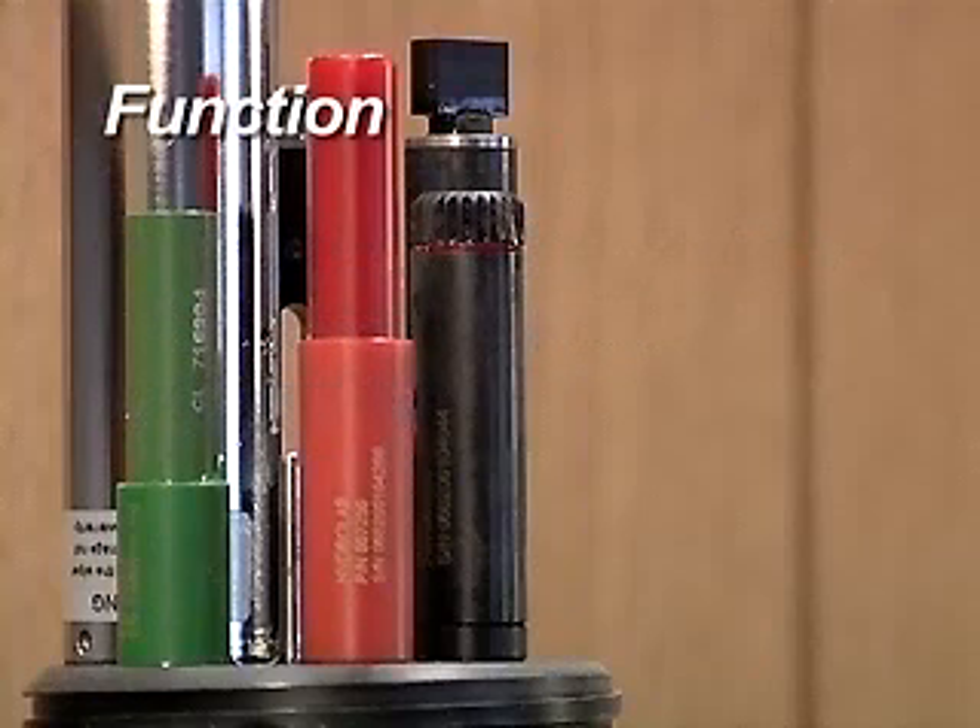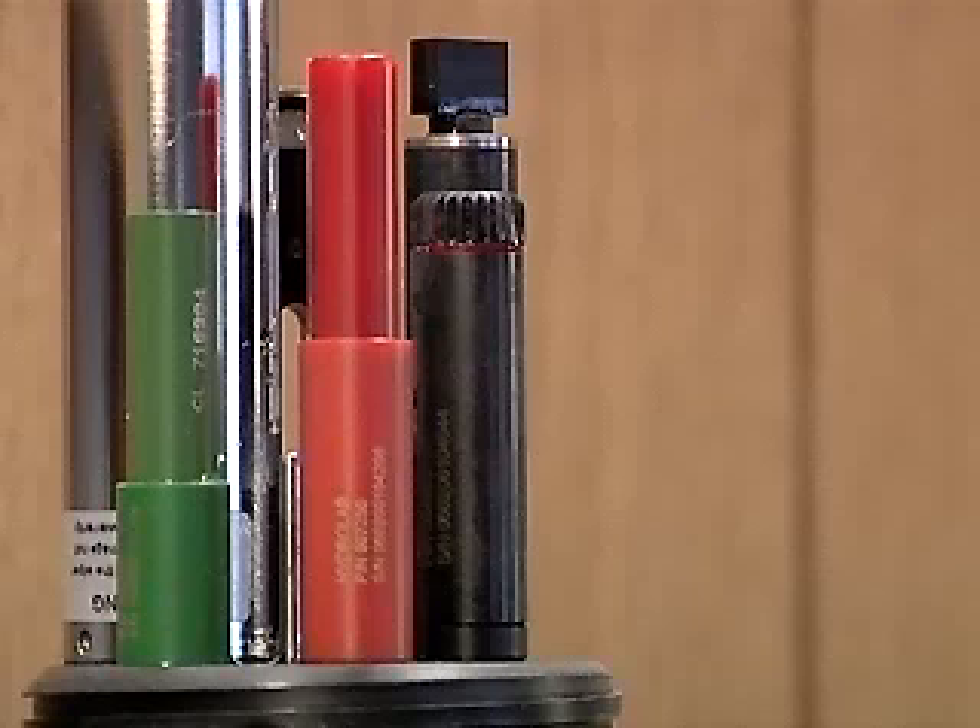The ammonium and nitrate ion sensors use two electrodes to measure the electrical potential between a known ion concentration and the sample. The electrode inside the sensor tip is surrounded by a solution of a known concentration of the appropriate ion. The other electrode is the reference electrode used by the pH sensor.